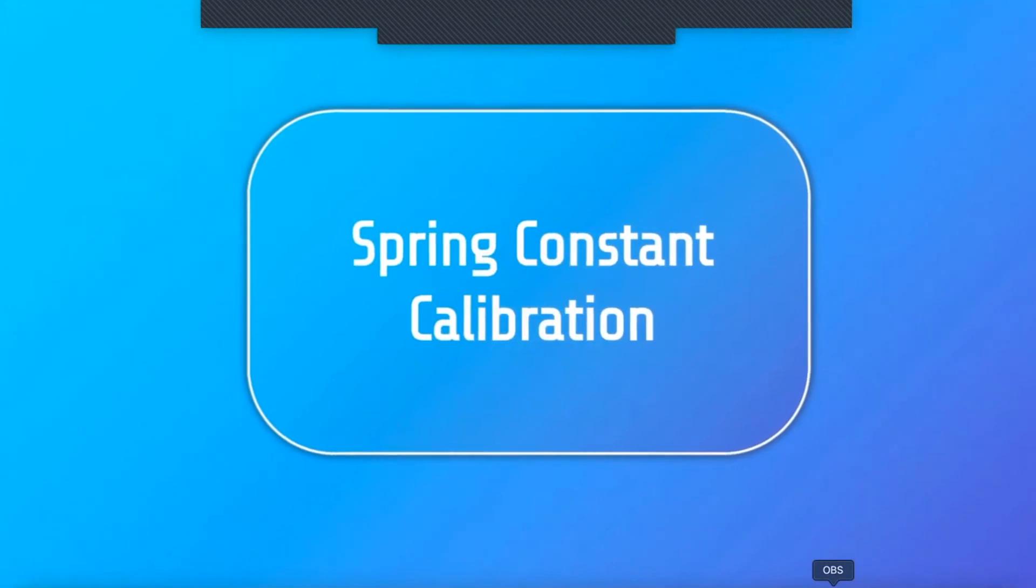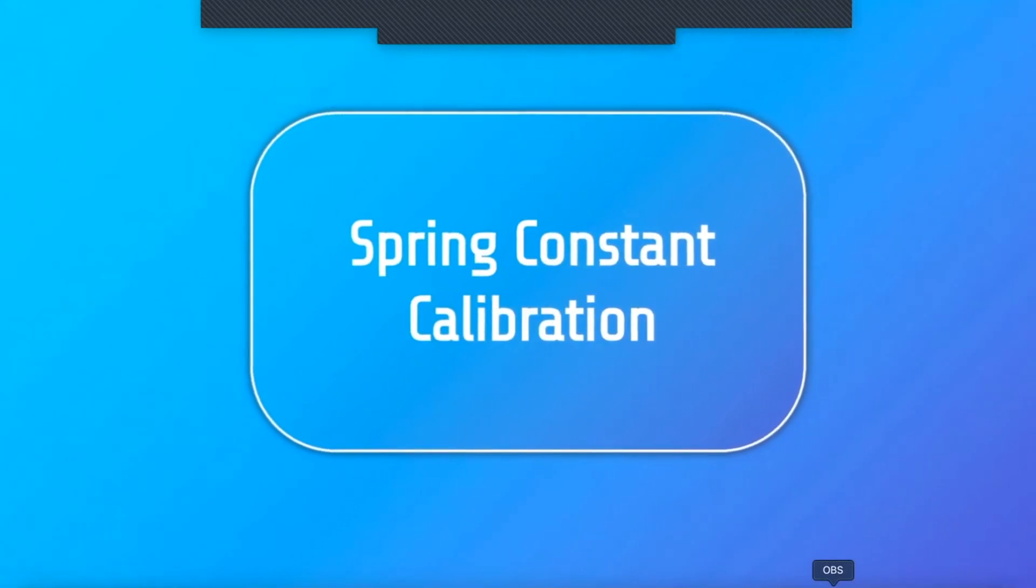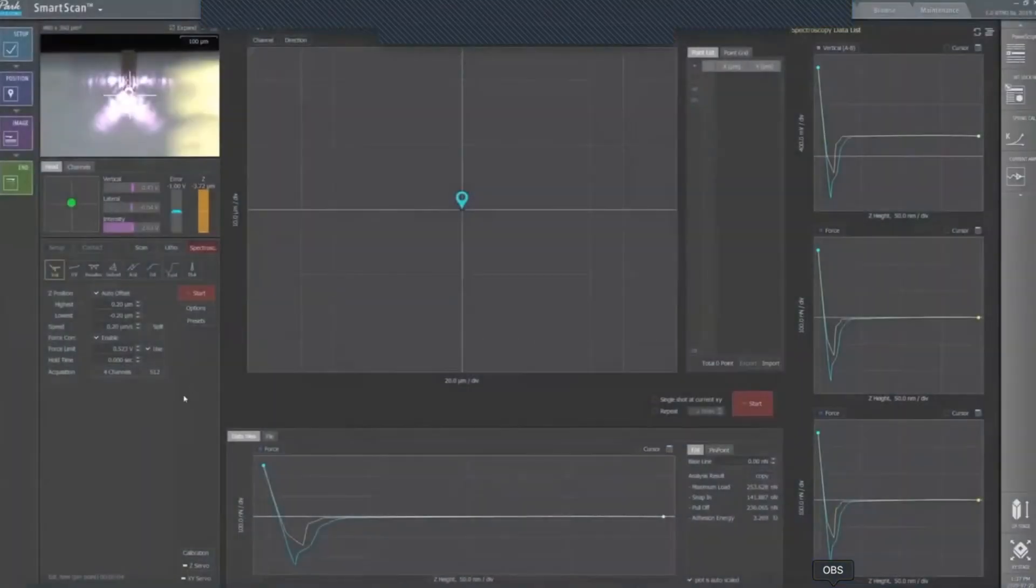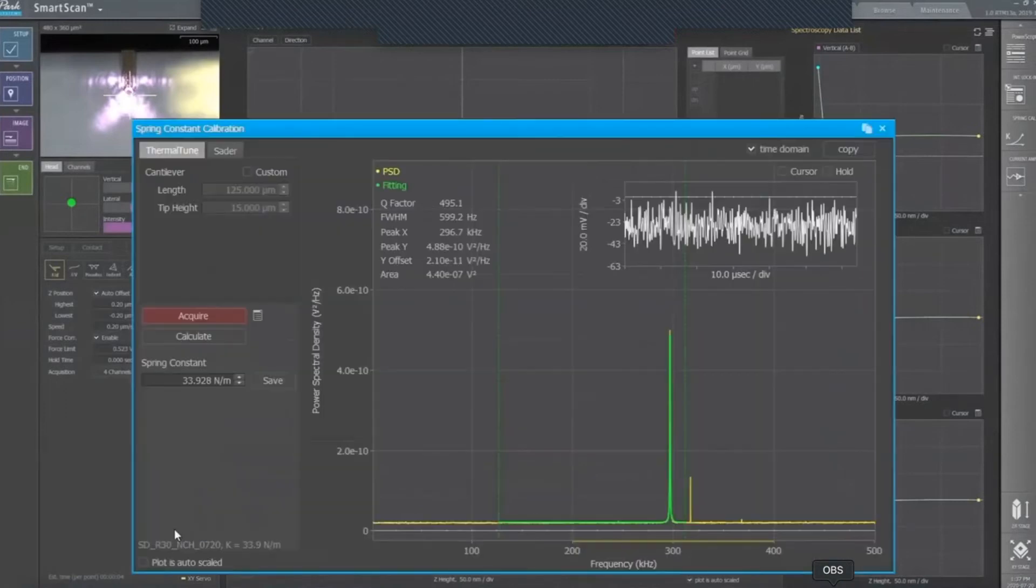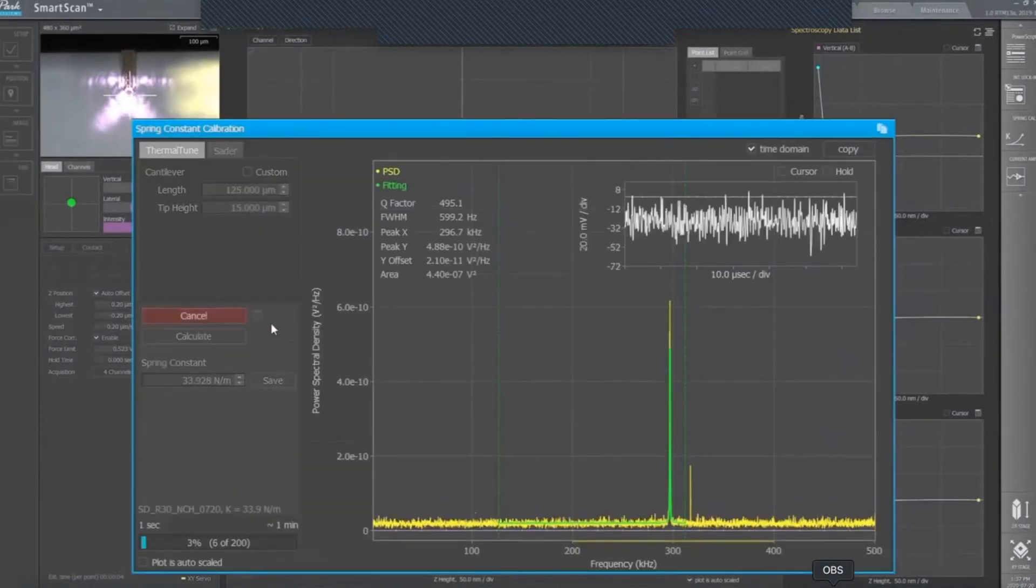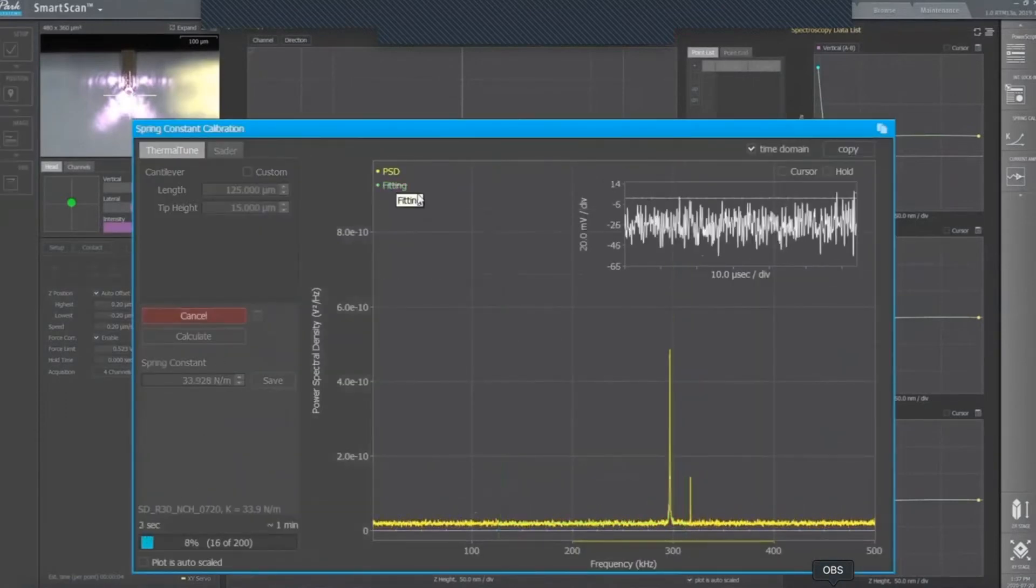Lastly, you must calibrate the spring constant. The software will perform a thermal tune and select the most prominent resonance peak that will be used to evaluate the force constant.